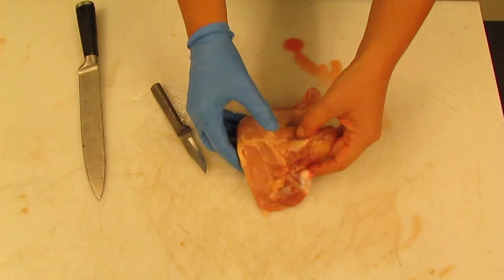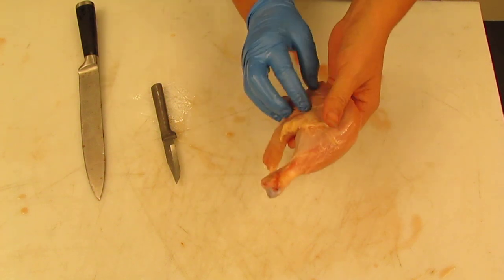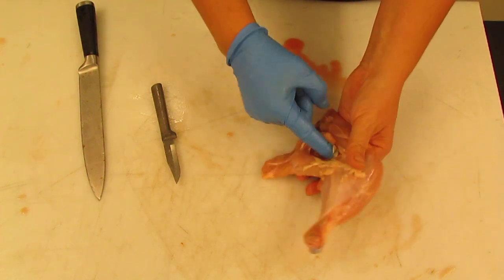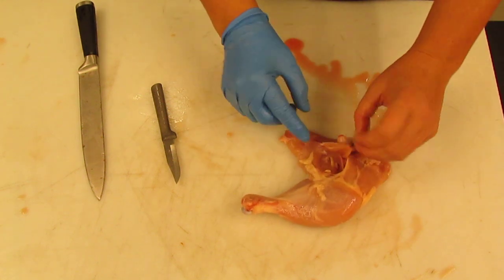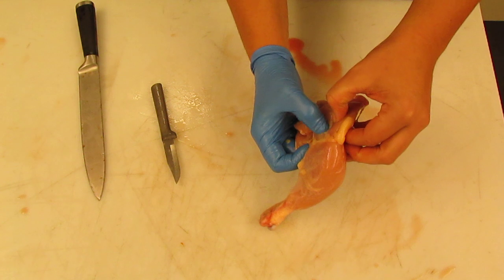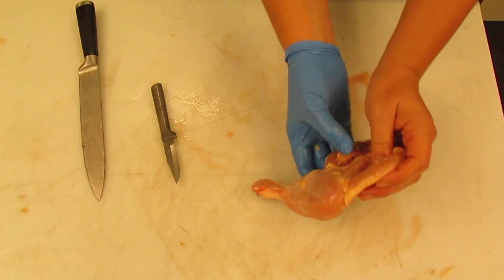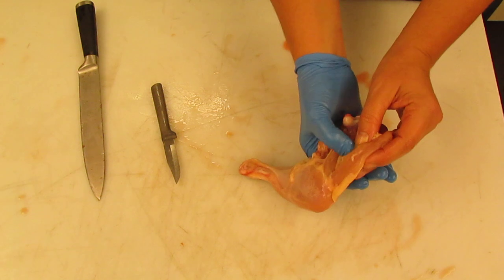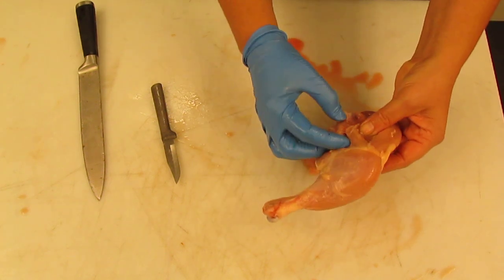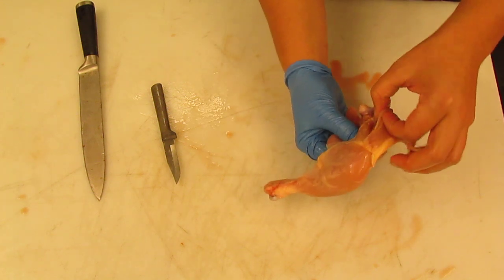All right, let's see. Next, you could explore these muscles just a little bit. In theory, you can push your finger in between the natural divisions of the muscles. Okay, so here, even without the knife, we can see that there are natural bundles of muscles. Remember that these are covered with epimysium. Okay, so they are their own independent muscles controlled by their own motor neurons. Okay, as I am starting to push these muscles a little bit out of the way, I can start to see a series of other structures.